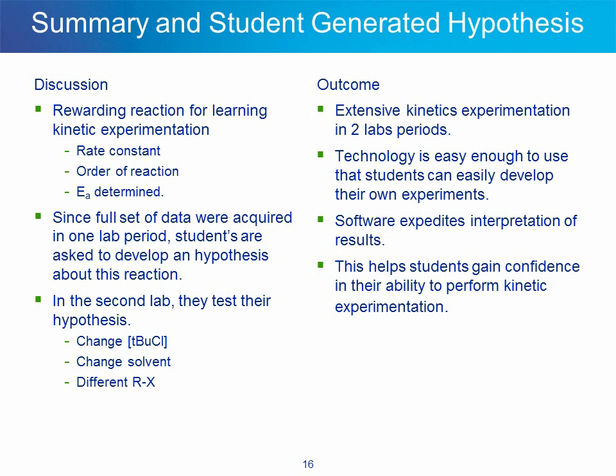In this slide, I'd like to discuss a summary and the concept of student-generated hypothesis for this first reaction. On the left column is my discussion. The hydrolysis of tertiary butyl chloride is a rewarding reaction for learning kinetic experimentation.